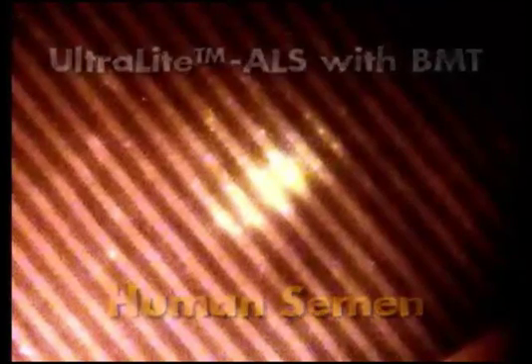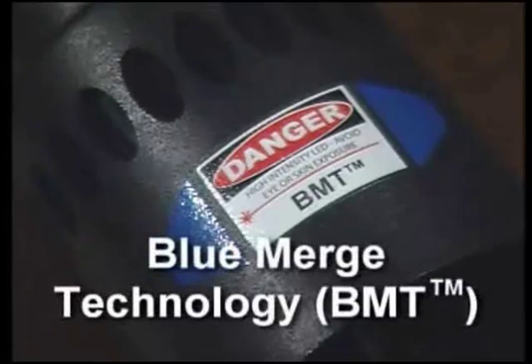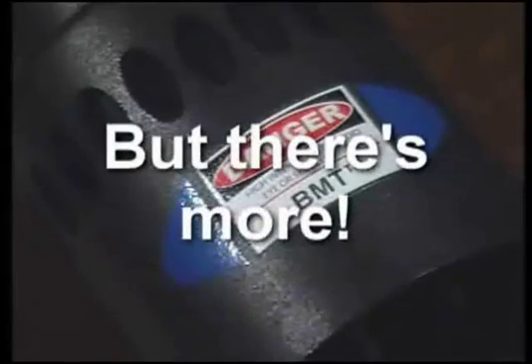It is very important to understand that the power of the ultralight ALS and the extraordinary cutting-edge Blue Merge technology incorporated in the BMT head has allowed us to view all the fingerprints and all of the body fluids with one head — the BMT head — one pair of amber glasses, and one amber camera filter. The ultralight ALS and the extraordinary cutting-edge Blue Merge technology will change the face of forensics worldwide, collecting more evidence faster and acquiring more solid convictions.